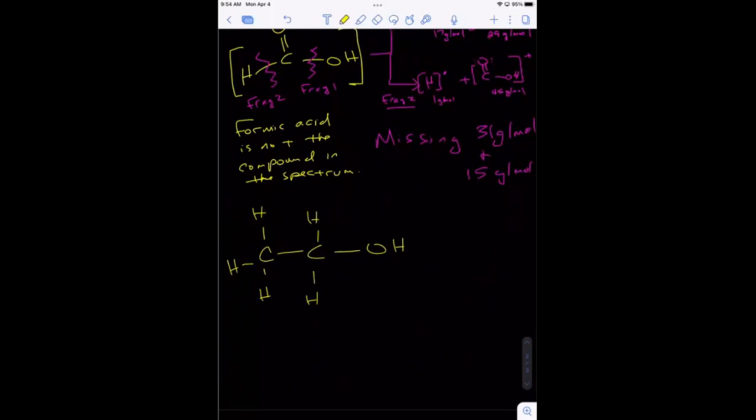But again, this is the easiest out of all of the techniques. This is the easiest one to understand because it's just adding up masses. If you've got a periodic table and you can find the atomic mass of an element, then you can figure out the mass of any fragment. And I know you can do it because it's not like y'all just got into college just because. Y'all are all capable of doing whatever you want to do. It's just chopping the molecule up, and there are specific fragmentation patterns for certain types of molecules. So we're going to learn those too.